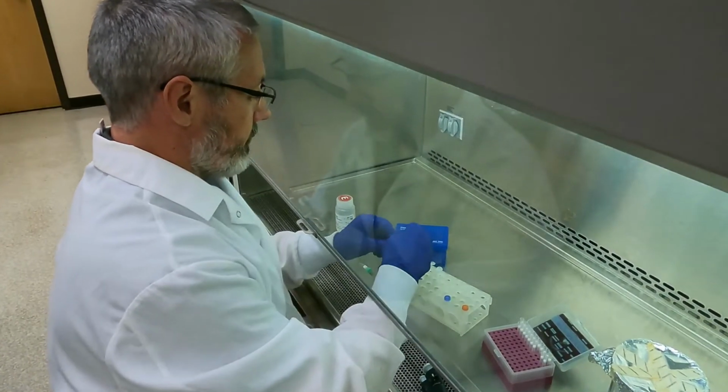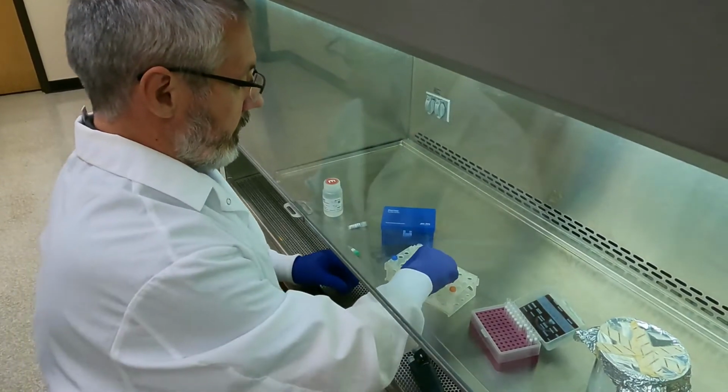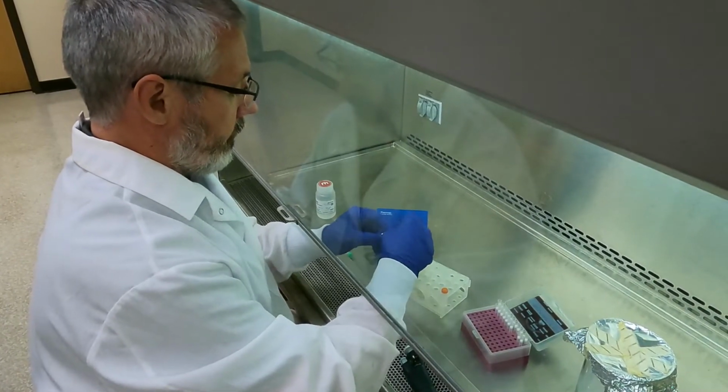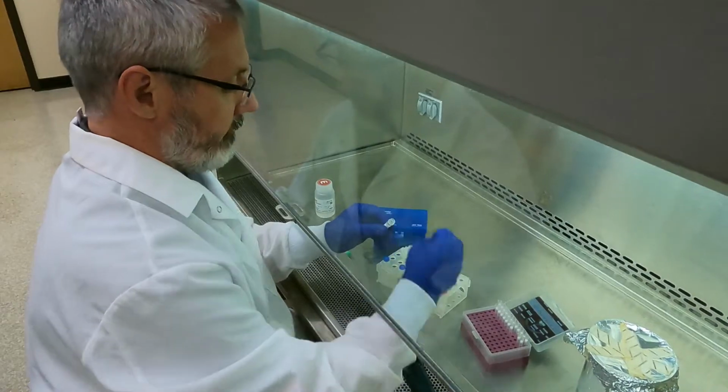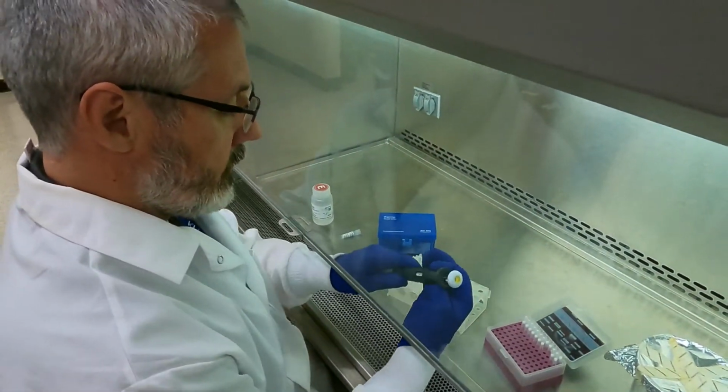So the good thing is that the RNA molecules, the CRISPRs themselves, go into solution very, very quickly. And nice and short. So here we go.